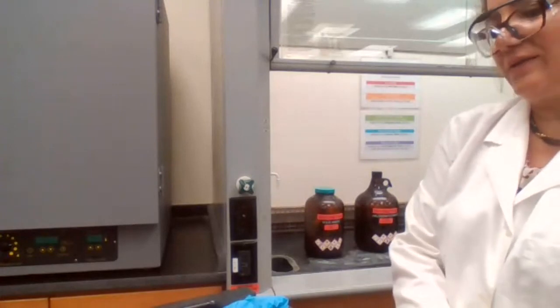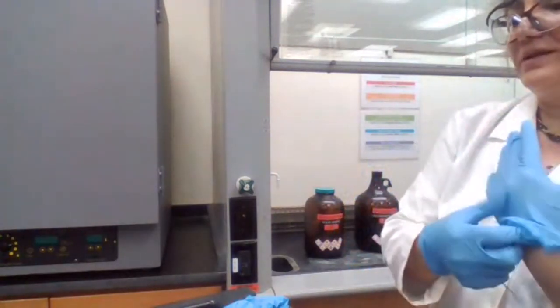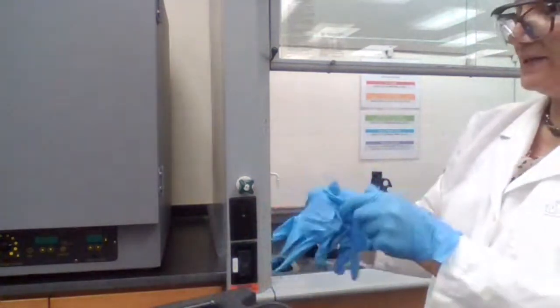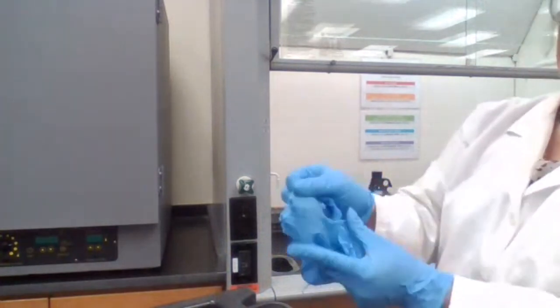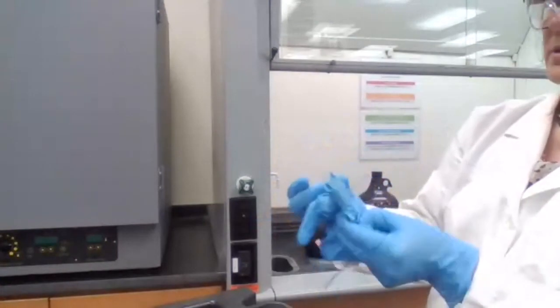And these days we're not supposed to touch our faces anyway, but the chance of that being transferred to your face is high. So I didn't dispose of it because I wanted to show you, even this color change to yellow, that's time for changing your gloves.